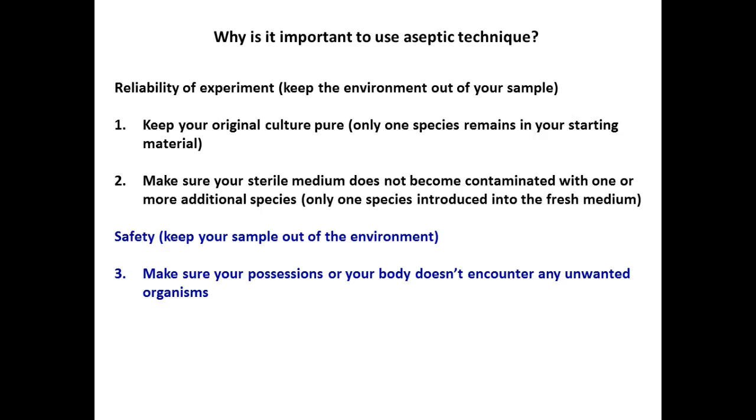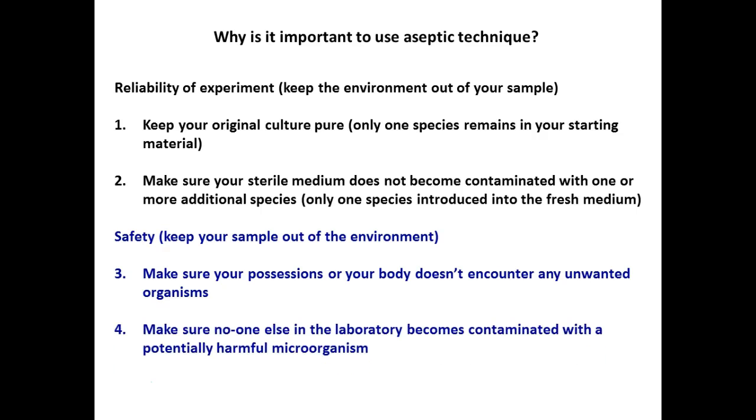So make sure our possessions or our body doesn't encounter any unwanted organisms, which is why, especially today, right, jackets hanging on back of chairs, all that stuff needs to go in the closet, right, because you don't want to spill on it. Make sure that no one else in the laboratory becomes contaminated, right, so if she hadn't wiped that up, someone else might not know it's there and picked up a large number of microorganisms.